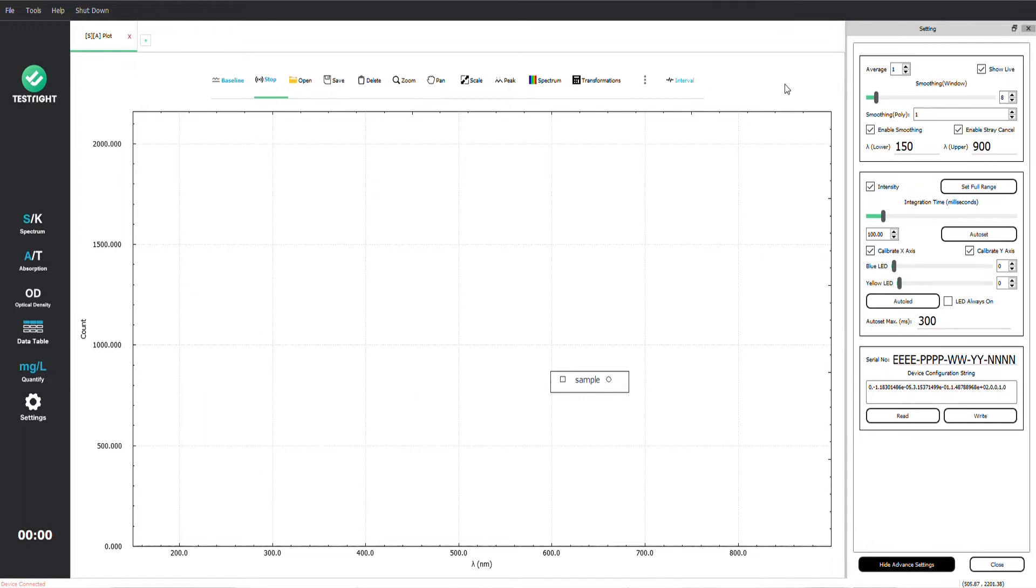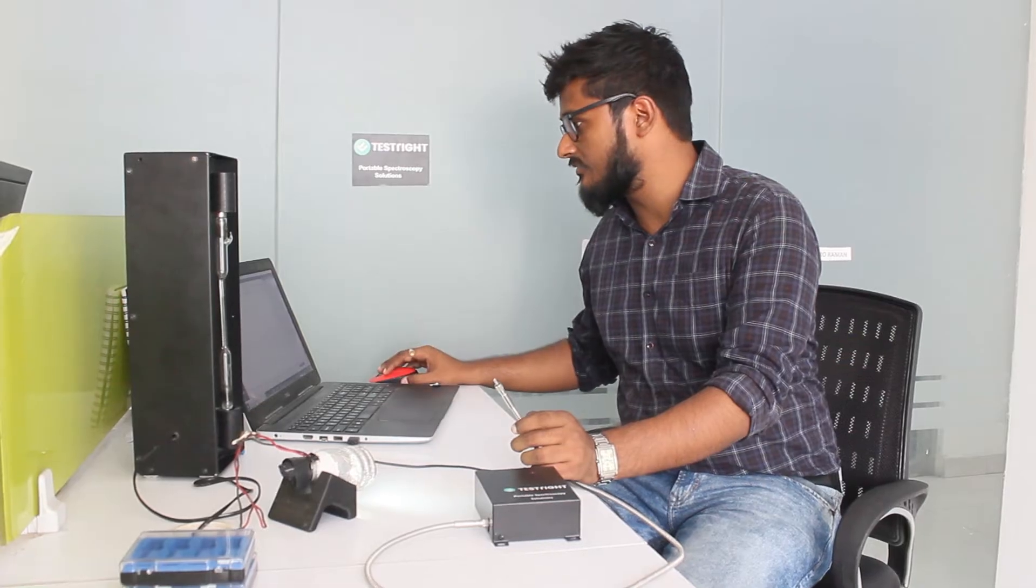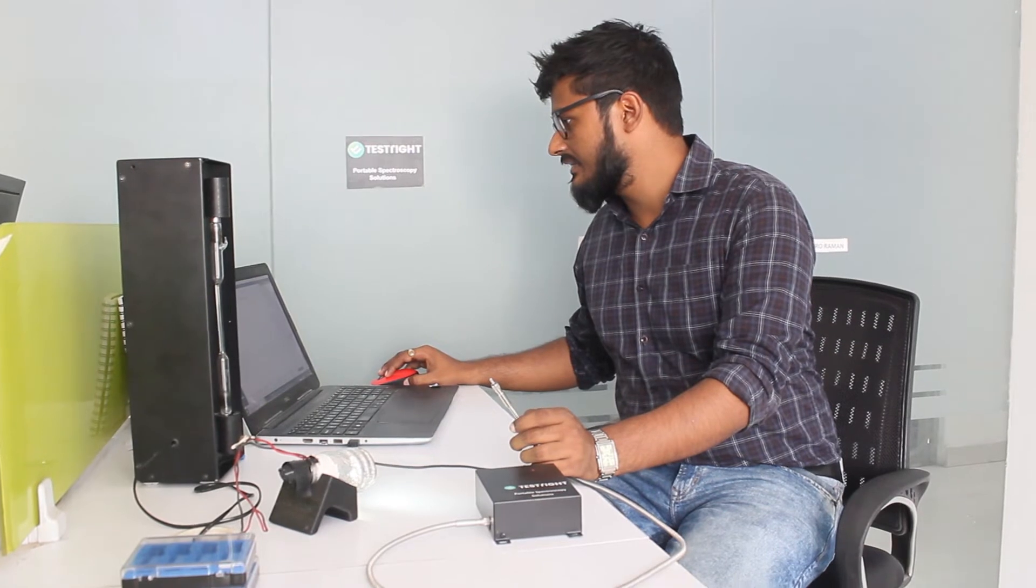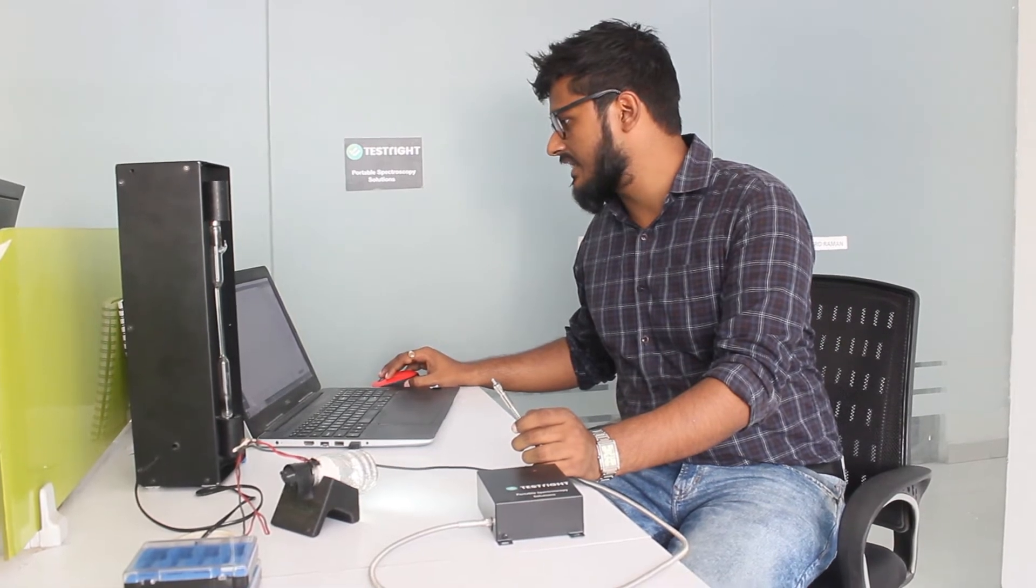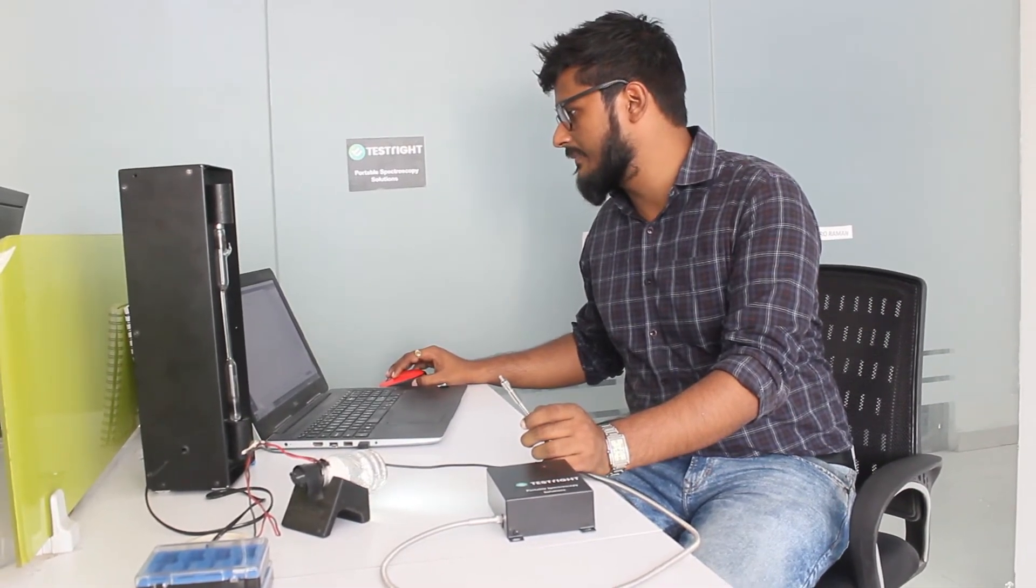The wavelength of detection has been set here from 150 to 900 and the integration time is at 15 milliseconds.